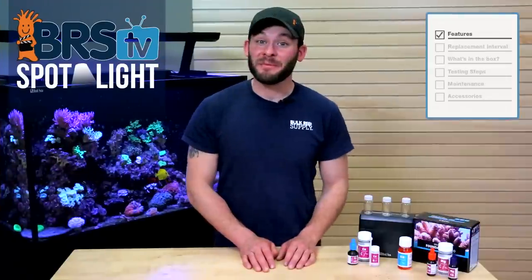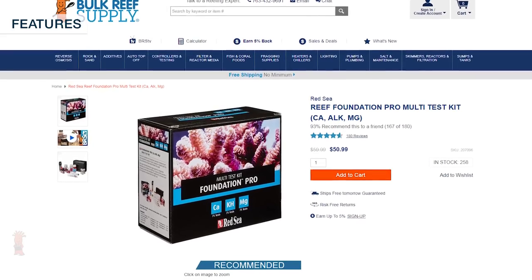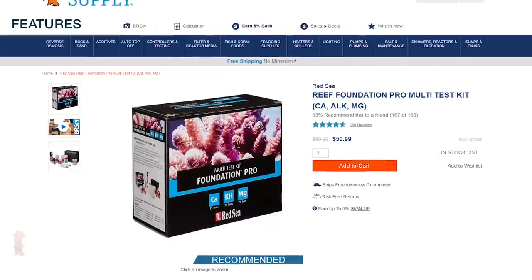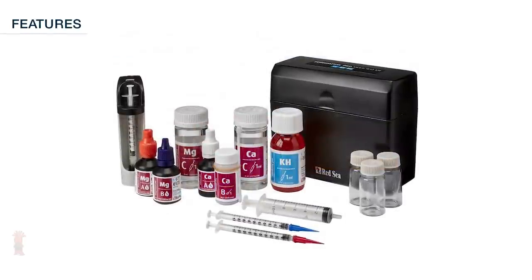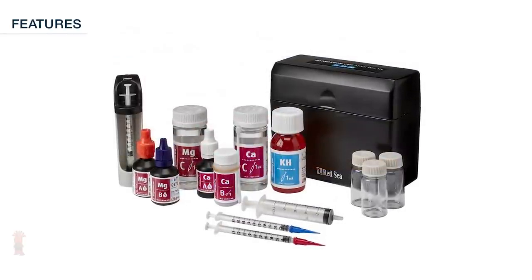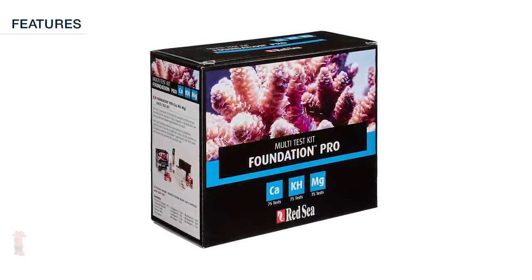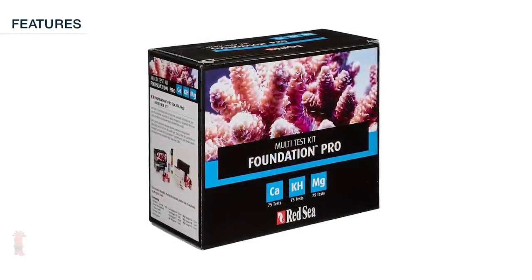Here at BRS we've been big fans of the individual Red Sea Pro test kits for some time, but even more so when Red Sea paired together the calcium, alkalinity, and magnesium tests into one cohesive kit. Because you get all three tests in one, you end up paying almost half of what you would if you picked them up individually, making them one of the most affordable test kits available at that level of quality and accuracy.